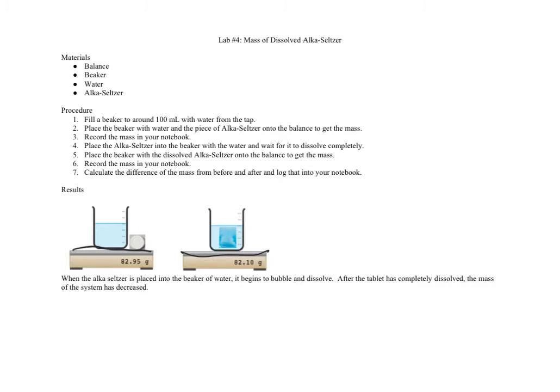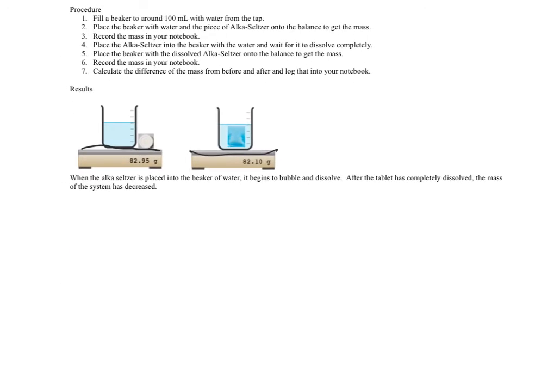One of the things you can notice is that there's some fizzing going on, and whenever we see fizzing, that usually means there's some release of a gas. We can draw a particle diagram for that too, where we've got particles of water and then some particles of the Alka-Seltzer.